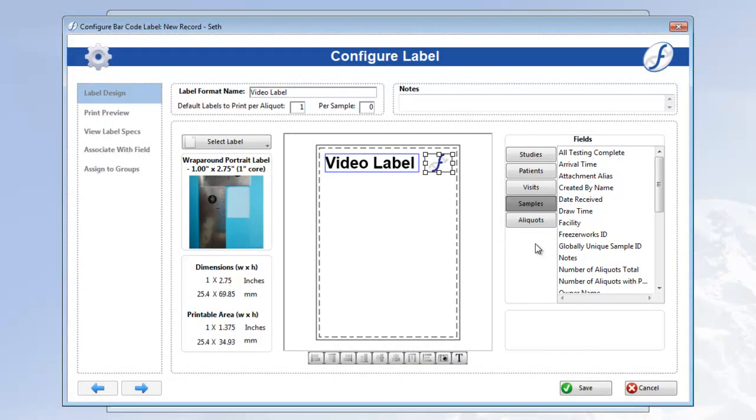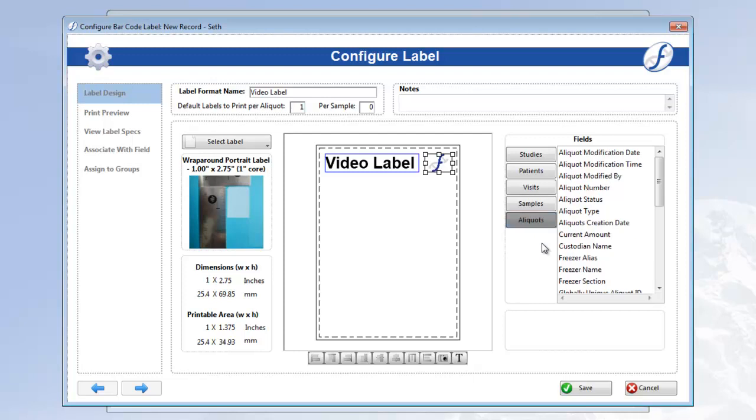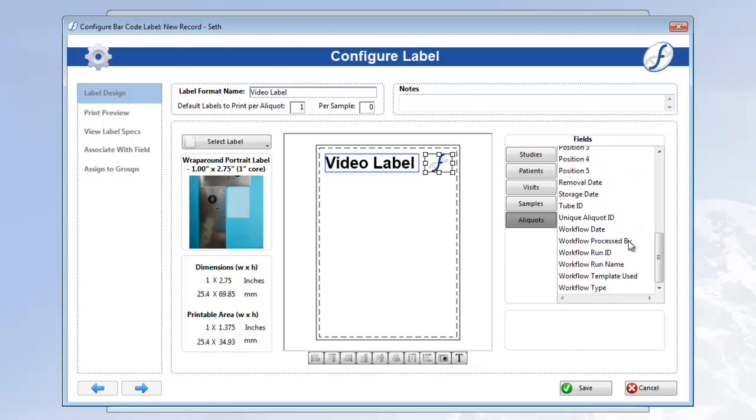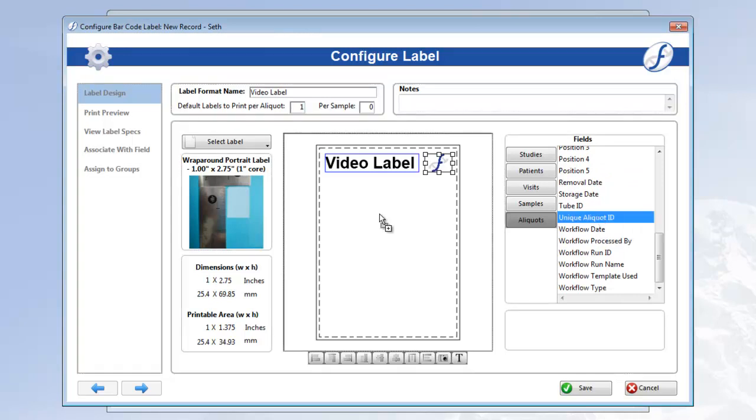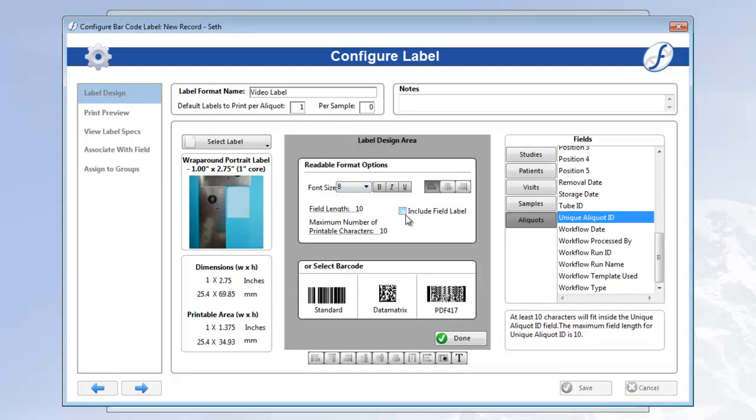Let's click and drag unique aliquot ID to the label format, since this is my ID field for aliquots and needs to be on the label. When I let go, I am presented with the various options for the field.